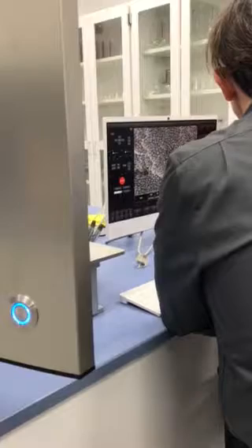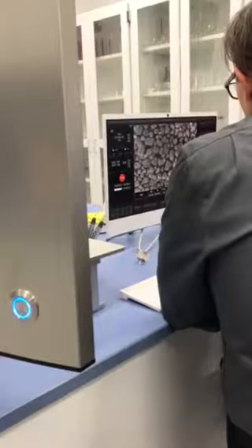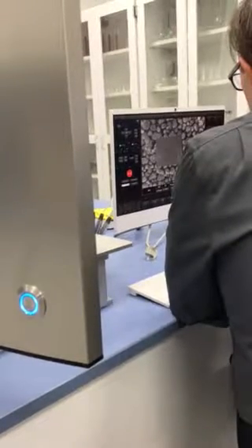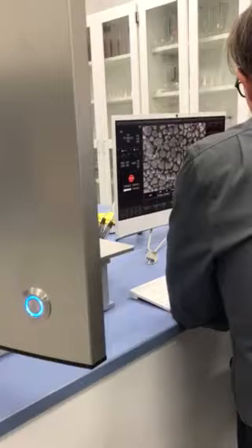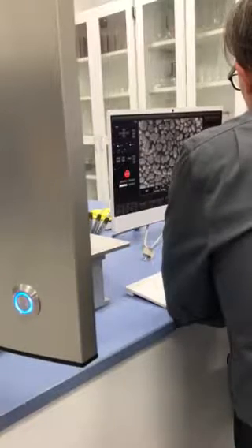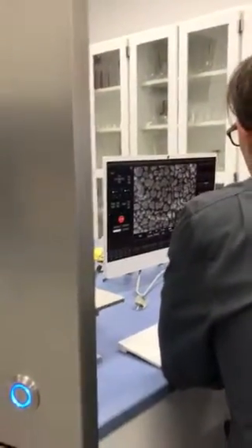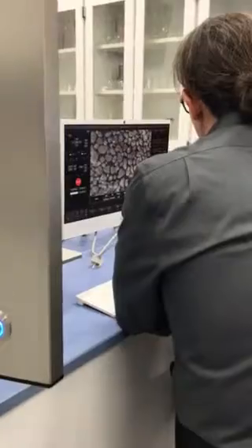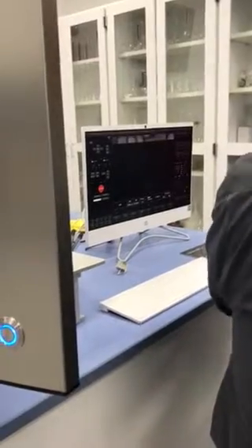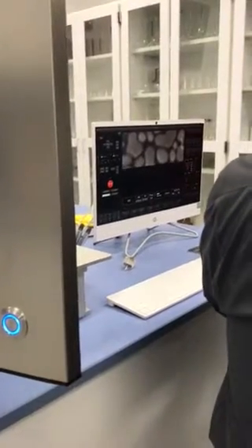It's a really very intuitive microscope to use. Let me just pop open the focus window. Focus is just a roll of a mouse, and then stigmate as well — a little bit of stig there, stigmate again. And so I just wanted to put in one of our polished samples here. So 140,000x — we could distinguish resolution details and we could distinguish spatial resolution.